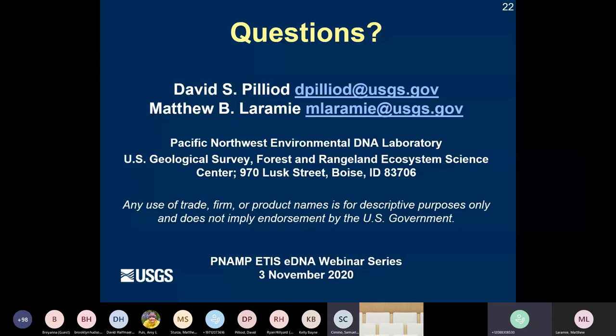Great, thanks. We have a question from India. What is the minimum concentration of eDNA extracted by the PCI method that can be used for metabarcoding study?